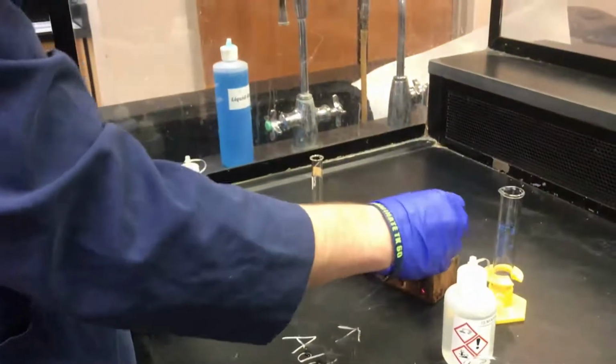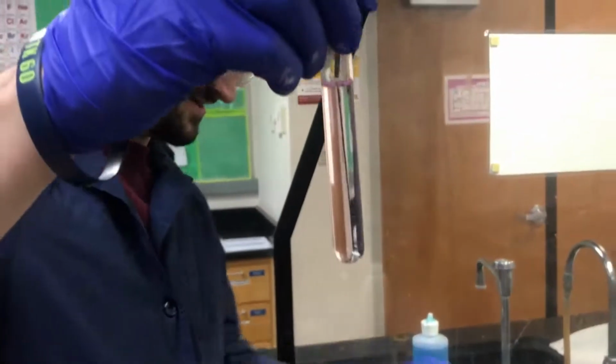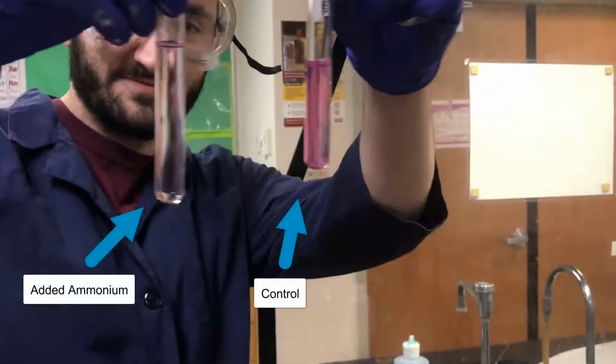And when we add the ammonium chloride, you'll see that the solution has turned pretty clear compared to the control.